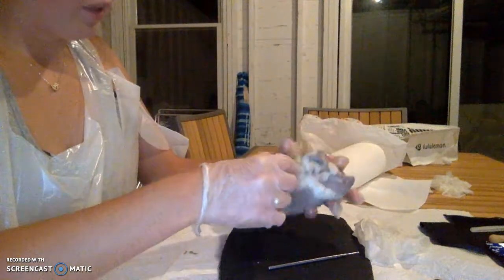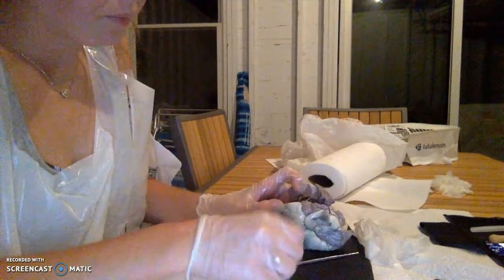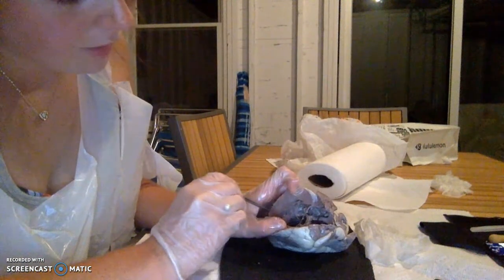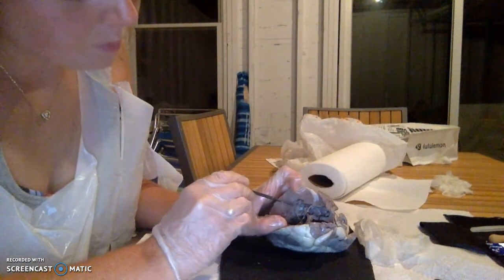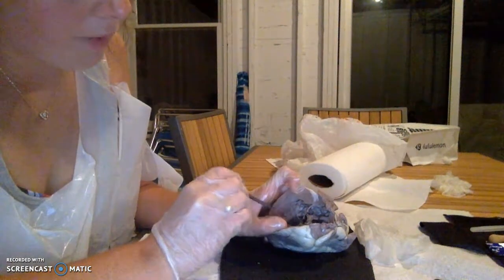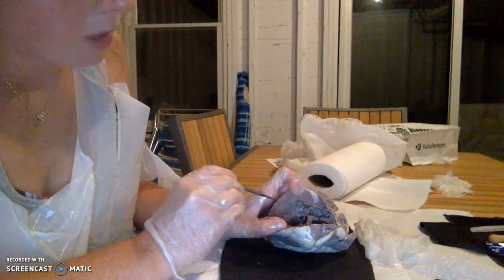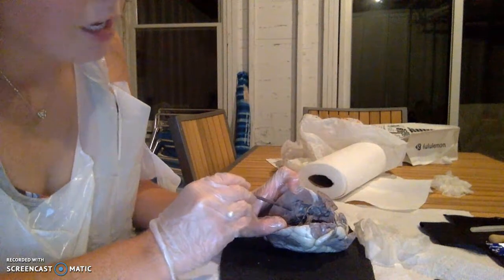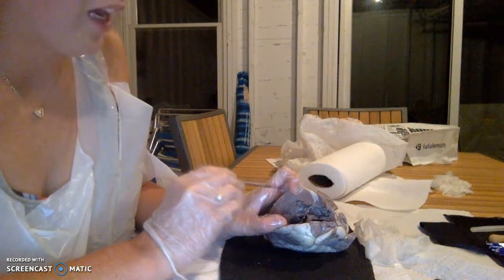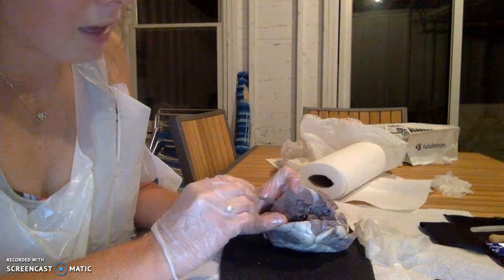And I'm going to start with the left side of the heart first. So to start, you have the left atrium, left ventricle. You have the left ventricle wall, which is here. You have the endocardium of the left ventricle, the myocardium of the left ventricle, and the epicardium of the left ventricle. The endocardium is the innermost part, the myocardium is the middle part, and the epicardium is the most outer part.